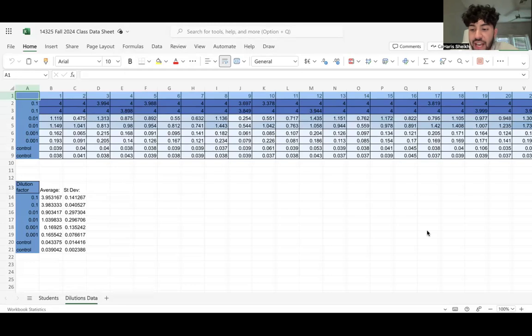I'm here to show you guys how to create the graphs that you did from your dilutions the other day. I know when I explained it in class, it was not exactly that straightforward, but after you watch this, it should make a lot of sense. And obviously, at first glance, it doesn't make sense. You can just rewatch it and copy the steps that I do. But I'll go ahead and get right into it.